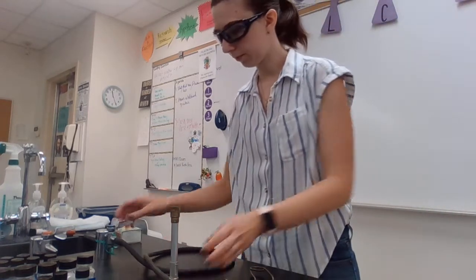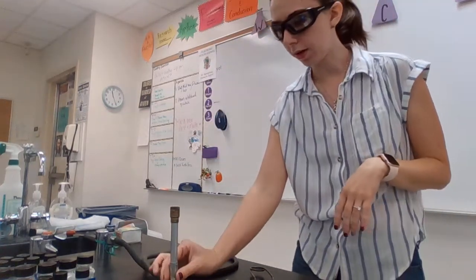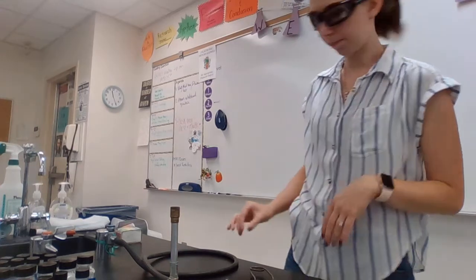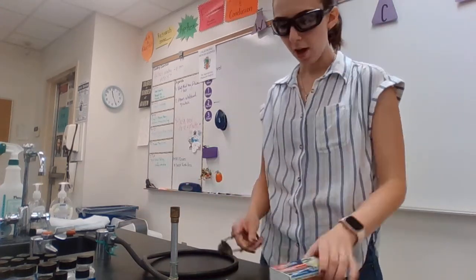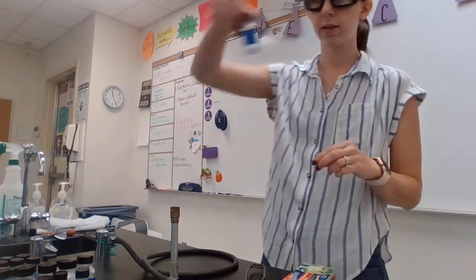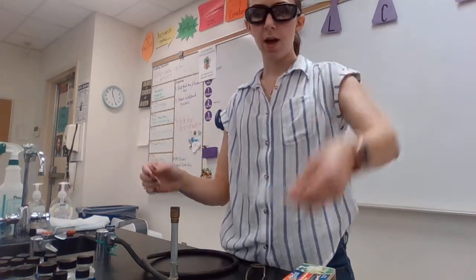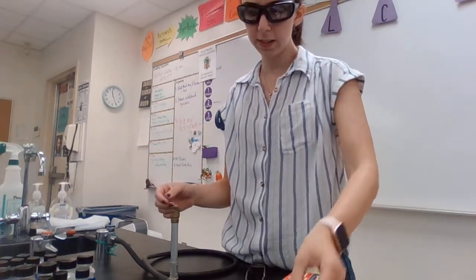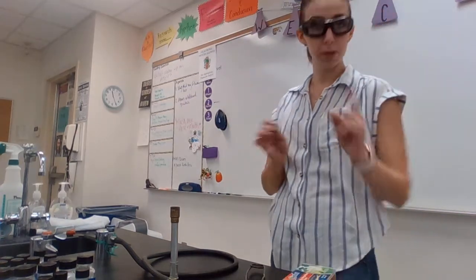So I'll show you guys the flame colors, and then you'll hypothesize what it might be that's in the bottles. So what we're going to do first is I make sure I have my safety goggles on, my hair is pulled back, and then we are going to start our flame two ways. We'll see if the striker works this morning. If not, we'll go with matches. Each of our salts already from our medicine are laid out here, and I have them in dishes with some deionized water, and we'll use those to create our flames. And we're going to rinse off between each flame.